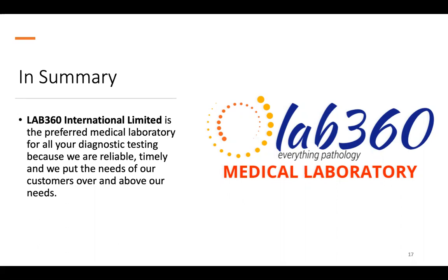At that initial stage, the samples are barcoded, as I've mentioned earlier on, so that when they go into the lab, they have a unique identification on them already. So this is one of the ways we work towards ensuring that there are no mismatches amongst the numerous patient samples we process on a daily basis. Hope this helps.